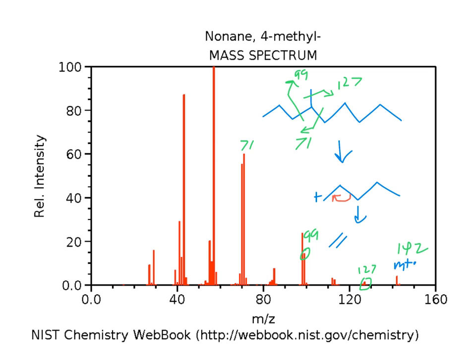So we form the alkene, and then this would also be at 43. So it may be that there are just more ways to form 43. Well, that's not even 43, the next one is 57. So maybe it's fragmenting still. Oops, sorry. This is 43.